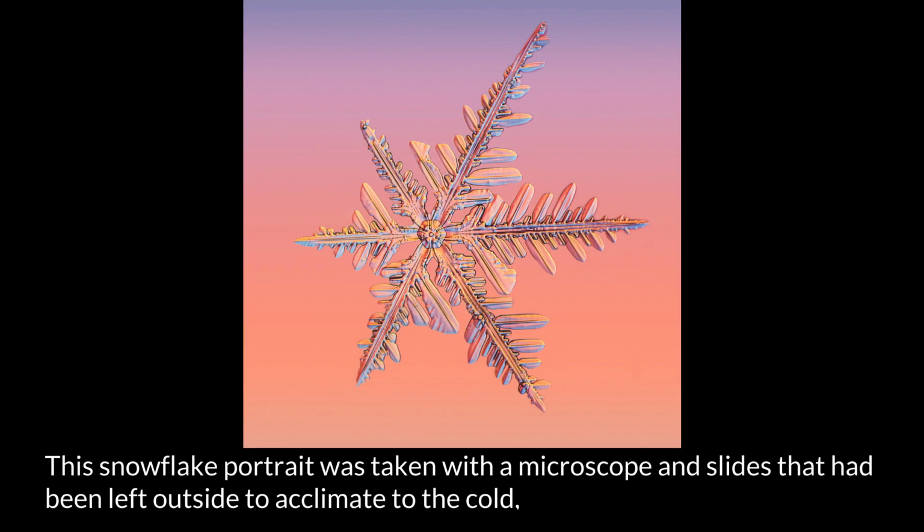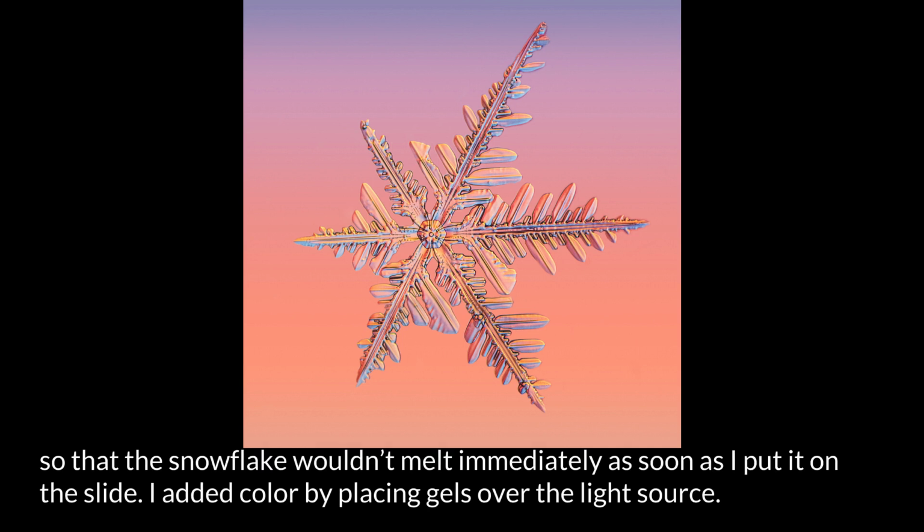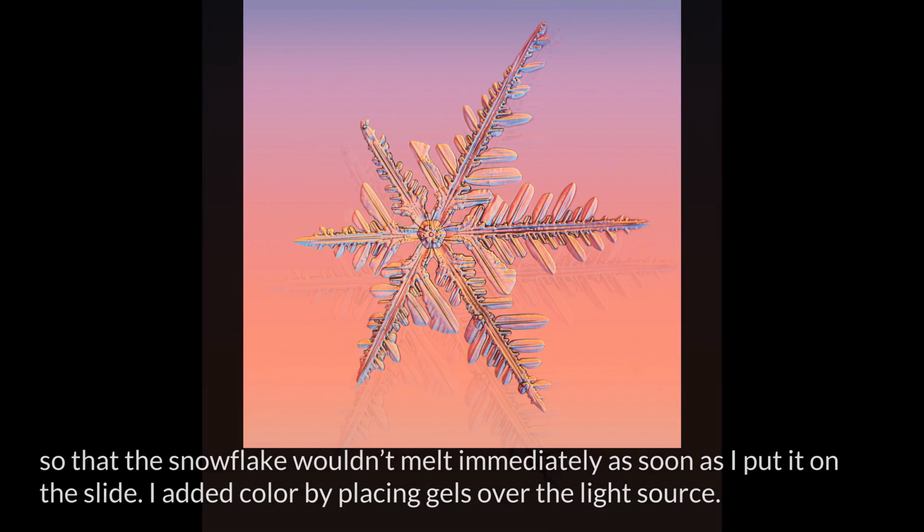This snowflake portrait was taken with a microscope and slides that had been left outside to acclimate to the cold, so that the snowflake wouldn't melt immediately as soon as I put it on the slide. I added color by placing gels over the light source.